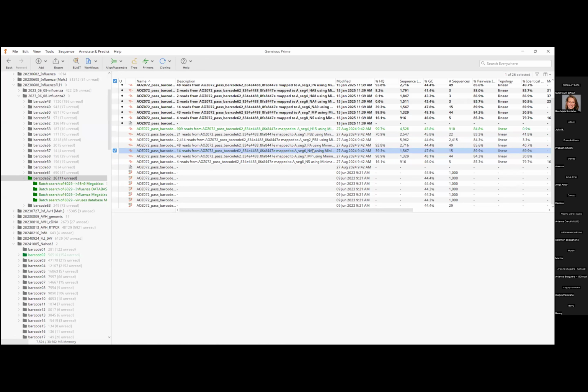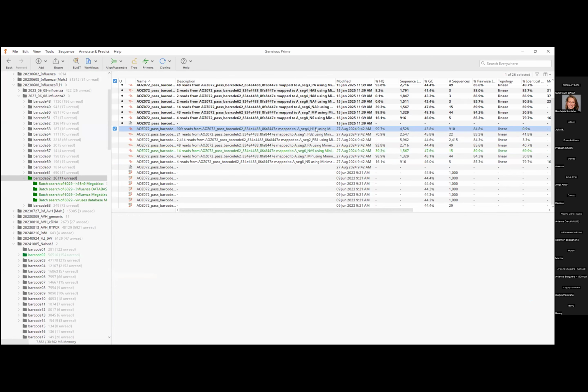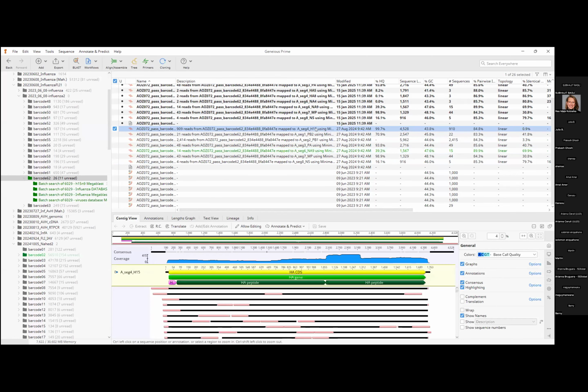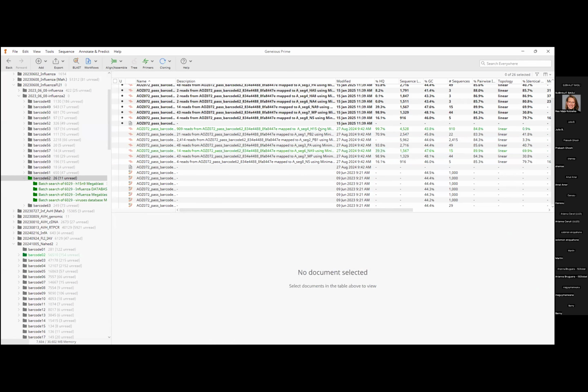So as you can see here, it's the 8 genes that influenza viruses have, and the reads that actually align to those genes. In our case, it aligned with H15 and N9. So I can say this is most probably H15N9 influenza virus. Okay, very handy.